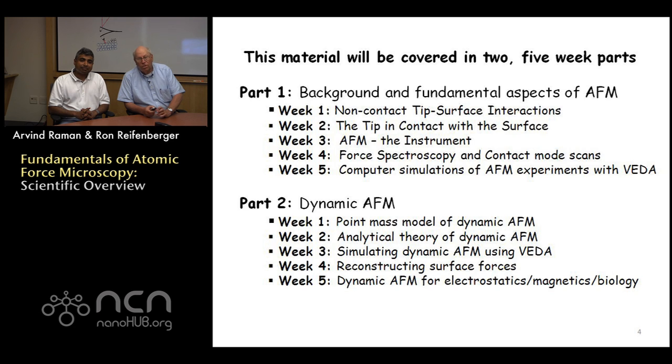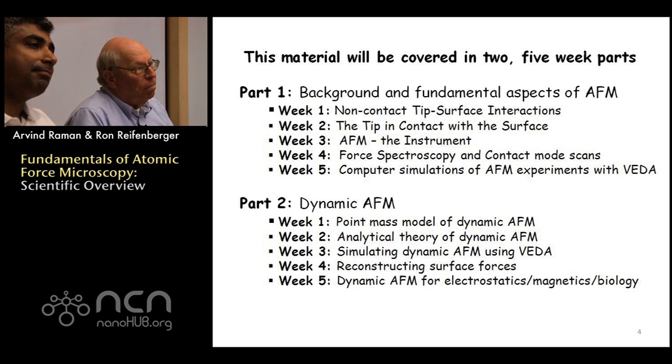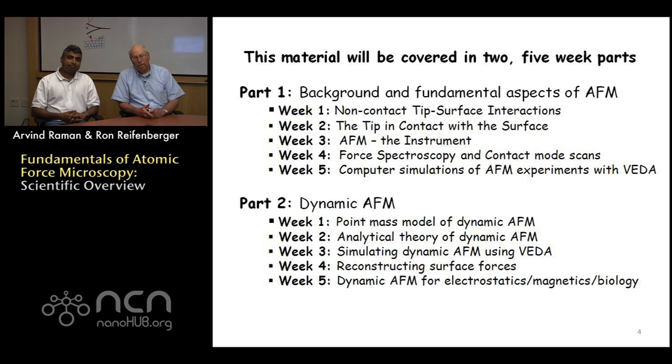Well, the course is split into two parts. Part one of the course will focus on the background and fundamental aspects of AFM. It'll focus largely on the static cantilever. We're going to talk about non-contact tip-surface interactions. We're going to show you how the equations that govern these interactions are derived. We're going to talk about the tip in contact with the surface. We're also going to broadly talk about the AFM as an instrument. We'll discuss force spectroscopy and contact mode scans.